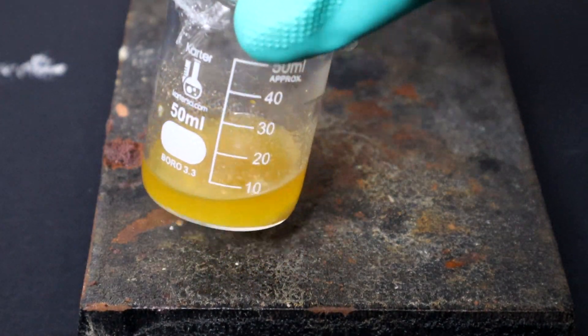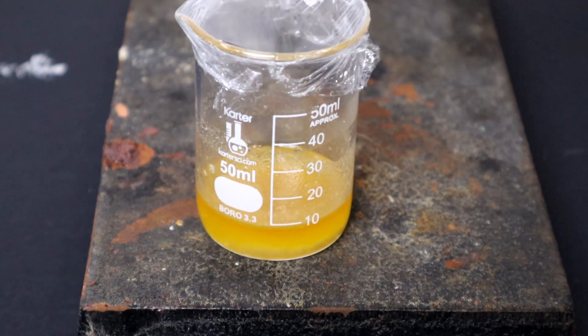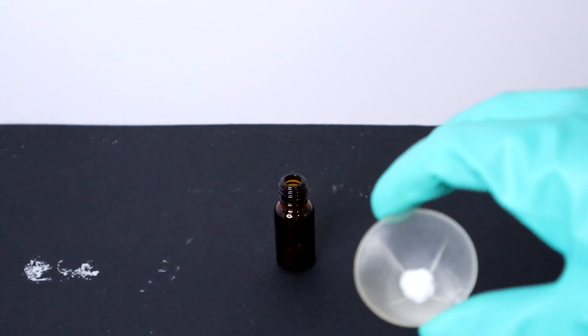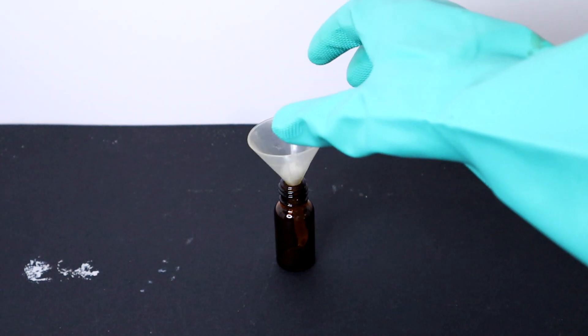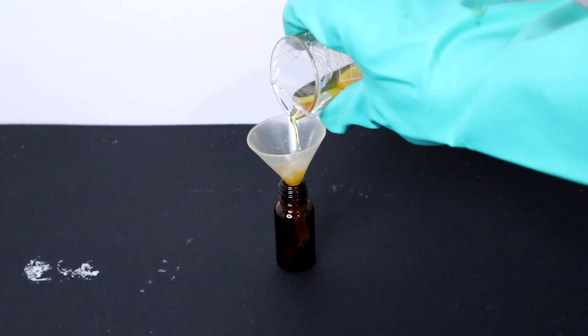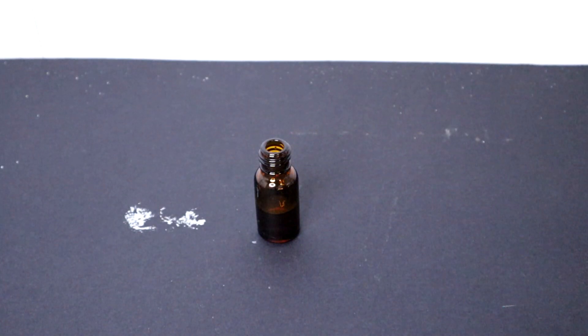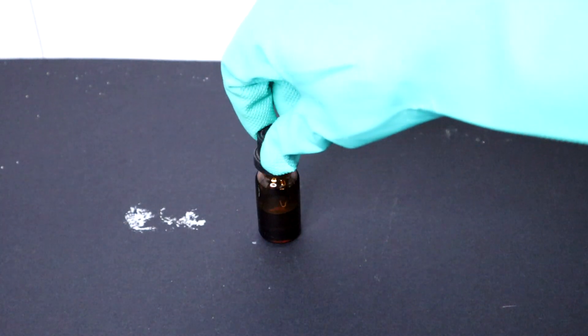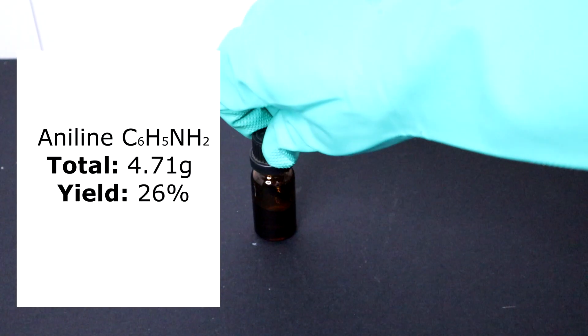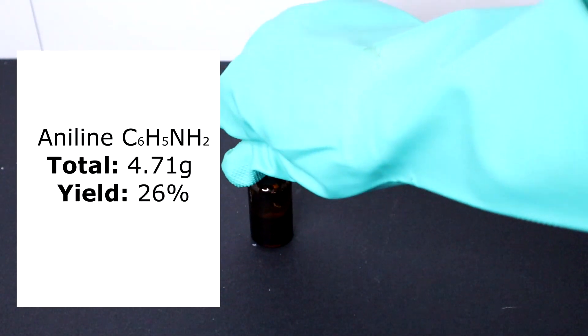After the solution turned clear, I simply filtered everything into a small pre-weighed amber glass bottle and tightened. In the end, I got 4.78g of a yellow liquid of crude aniline, which I'll be using in an upcoming video.